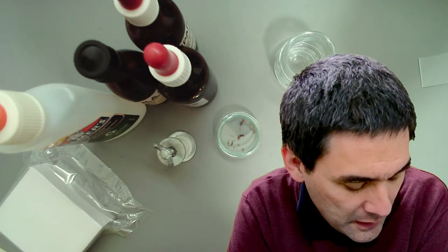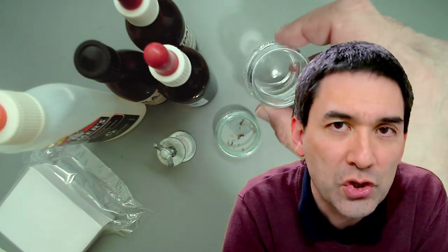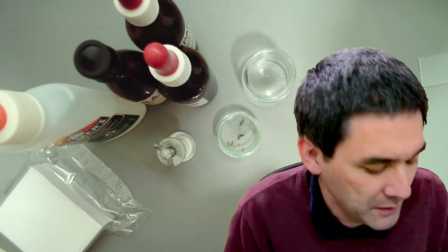Okay. Today, I want to make some permanent slides here, and I also want to quickly mention that there was a comment already a few hours ago, the very first comment, and the comment is not visible anymore, unfortunately. The comment was: how can you reduce bubbles by making those mounts, and it was suggested to use soap water. So what I've got here is also some soap water, and if you put the specimen into soap water first, this will reduce bubble formation. The reason is because the soap water breaks the surface tension, and therefore it's going to work better.